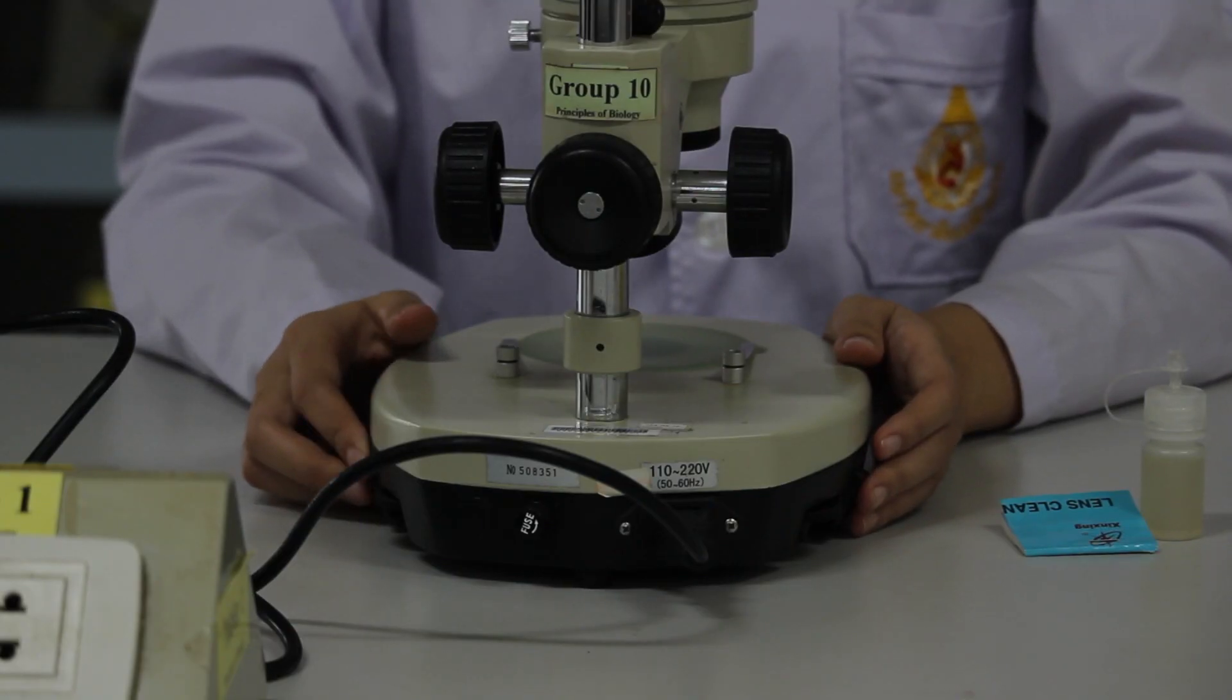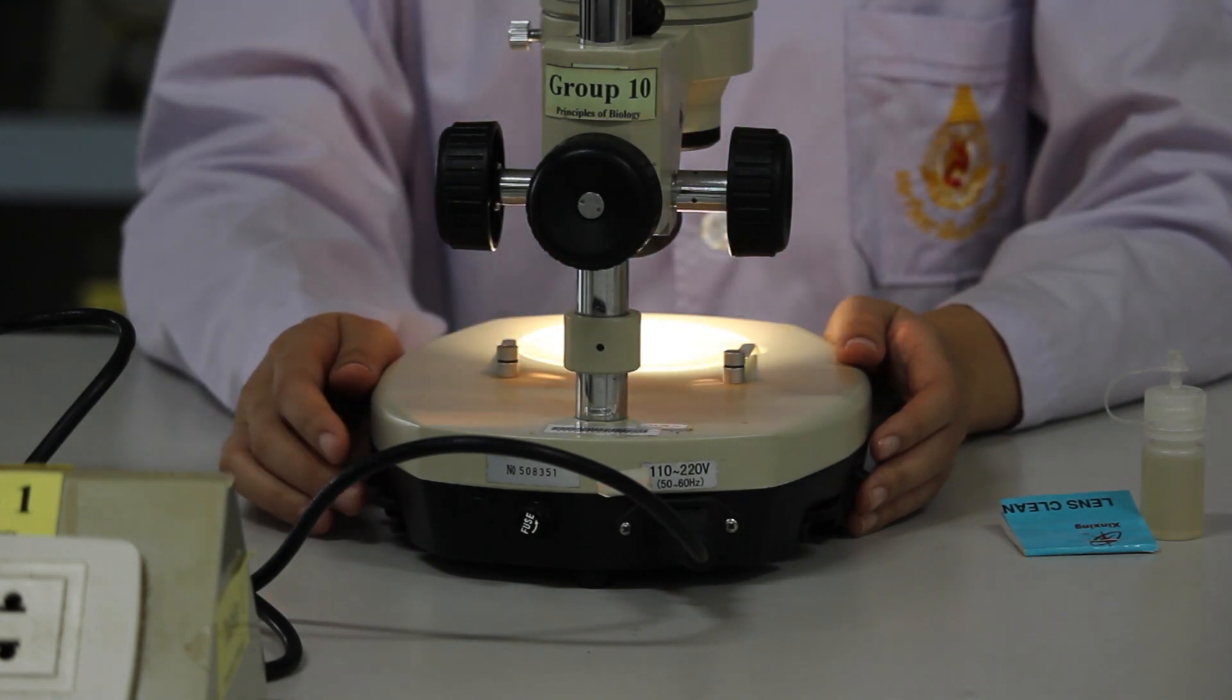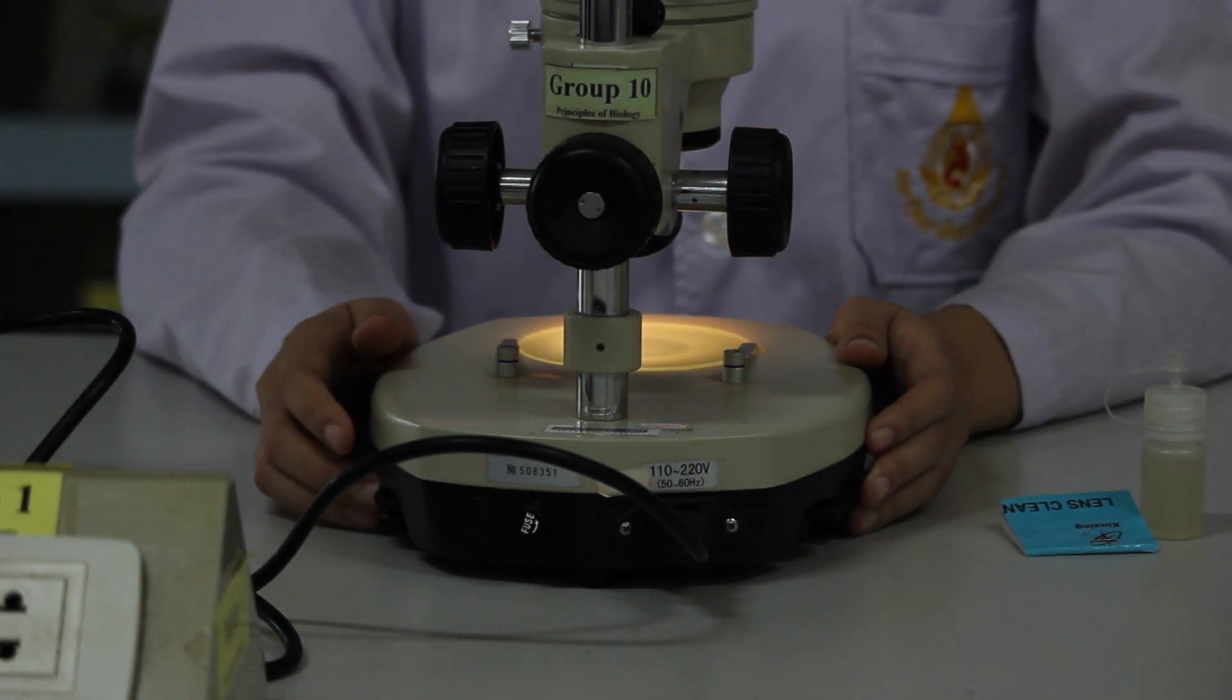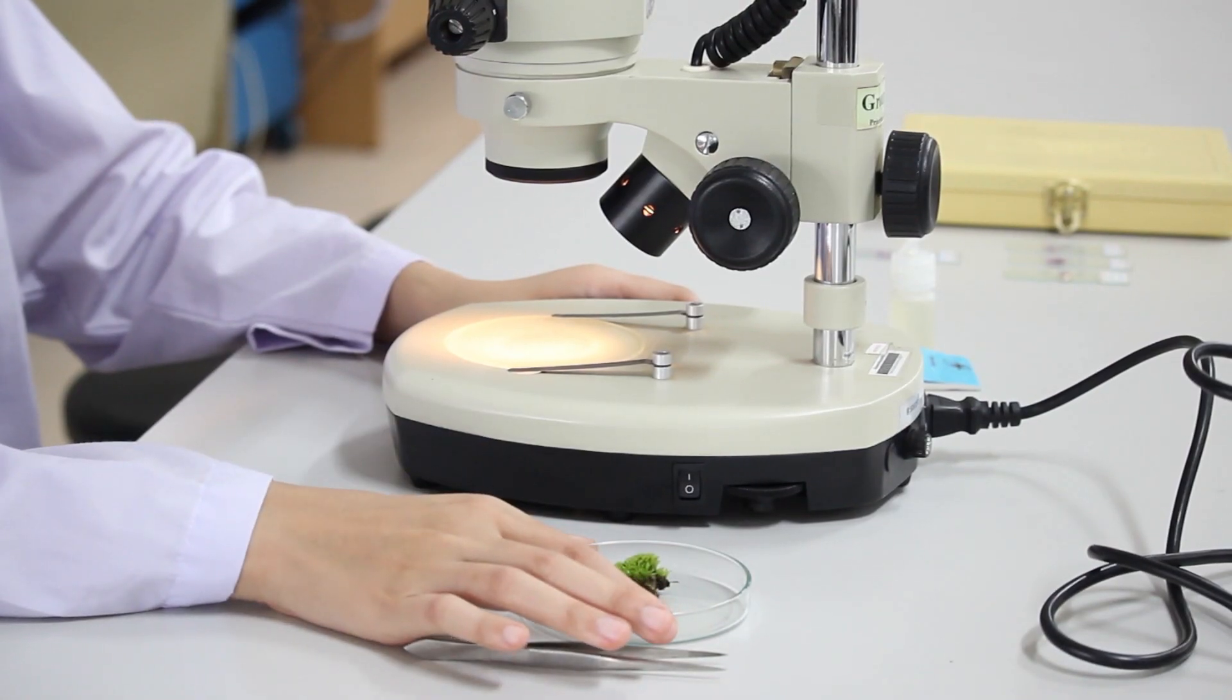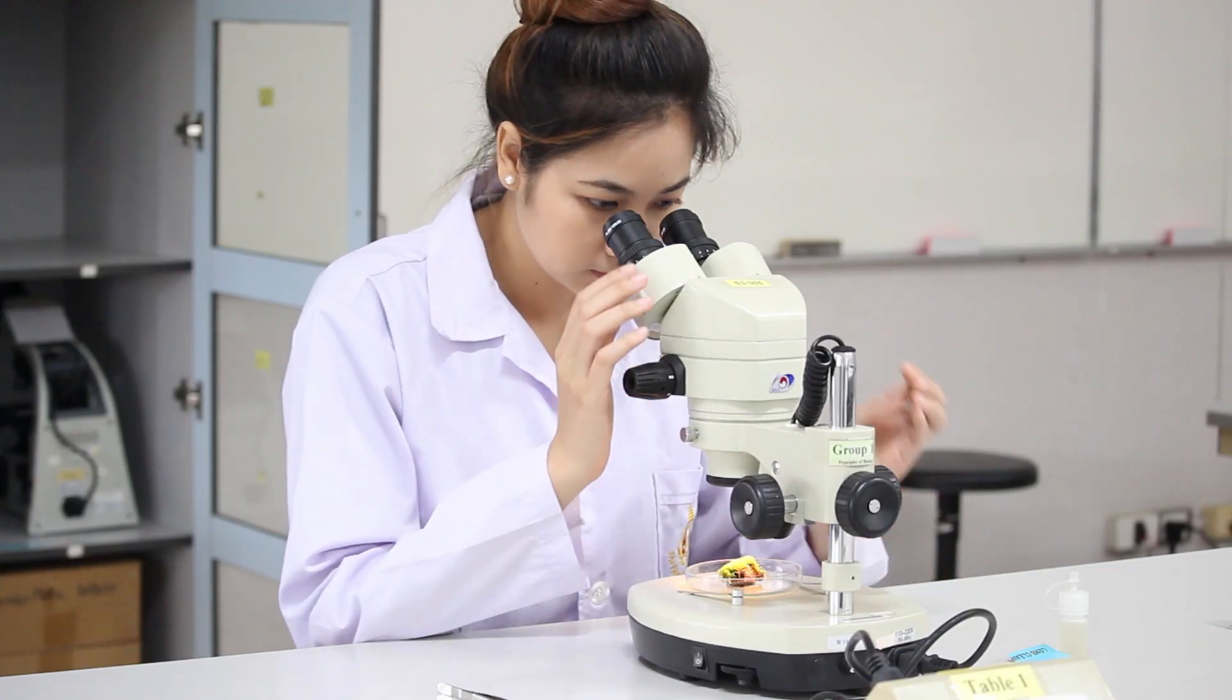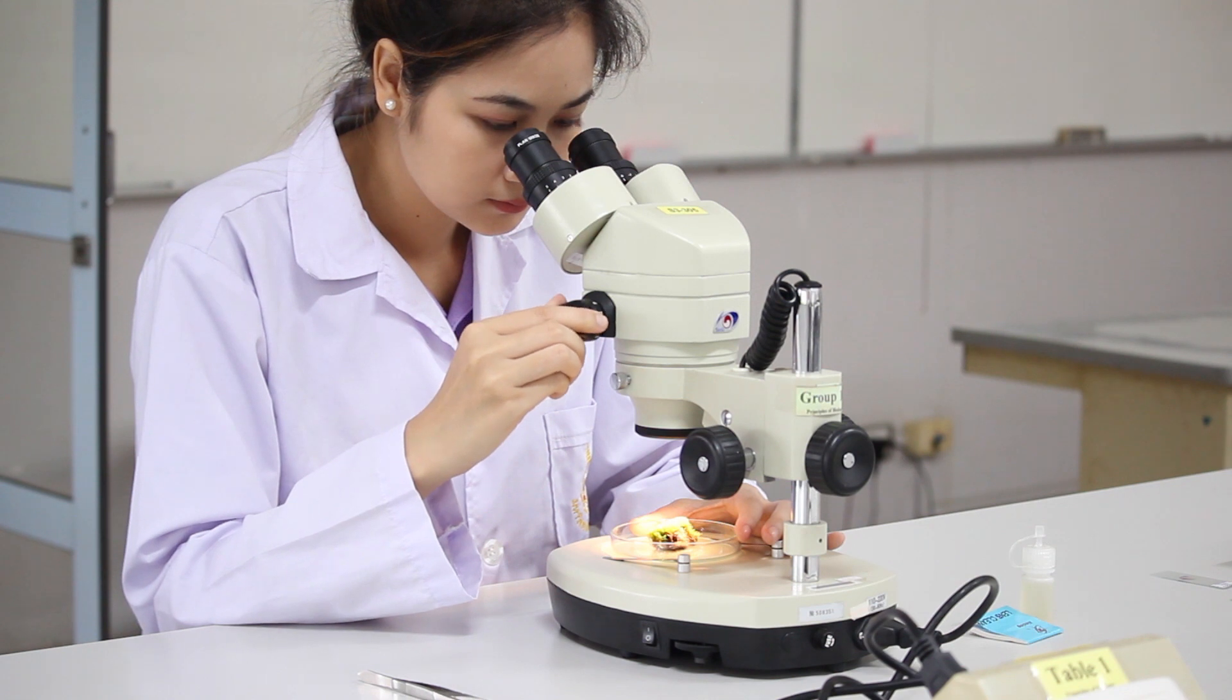Next, turn on the light sources on the stereo microscope. The stereo microscope has two light sources: one from below and the other one from above. The switches are at the left and the right side of the microscope. After that, adjust the light intensity by turning the light adjustment scale located next to the light switch. Put the specimen on the stage and look into the eyepieces. And then, adjust the magnification knob to an appropriate magnification.